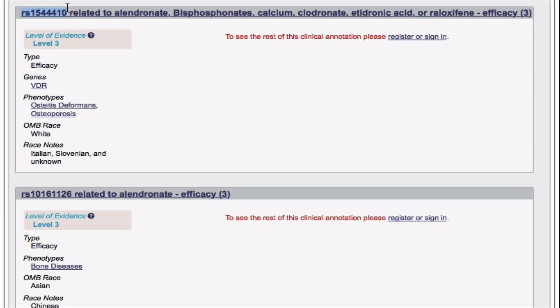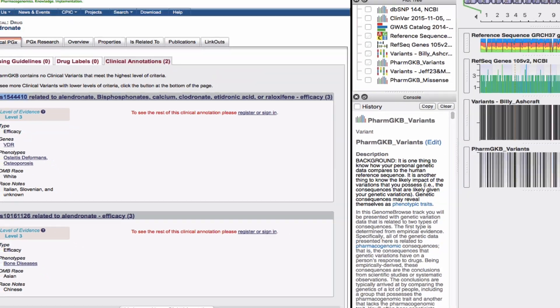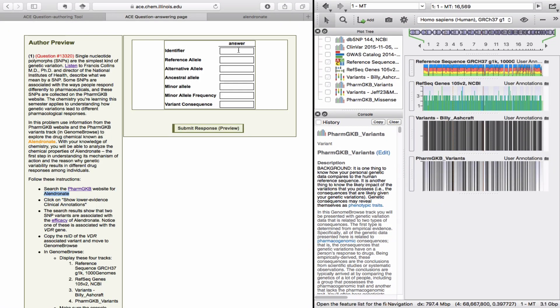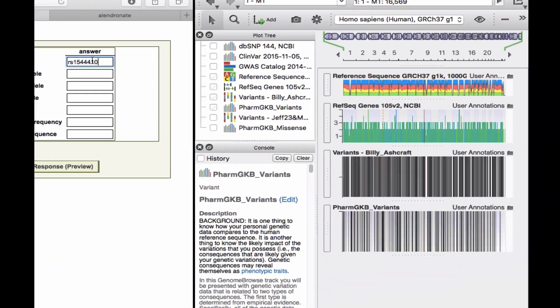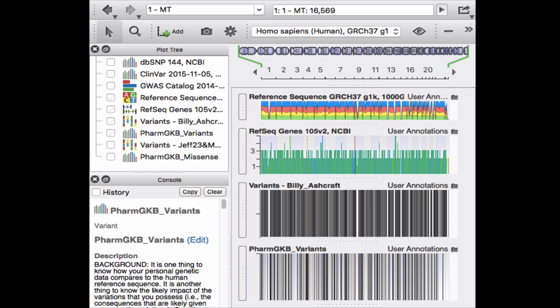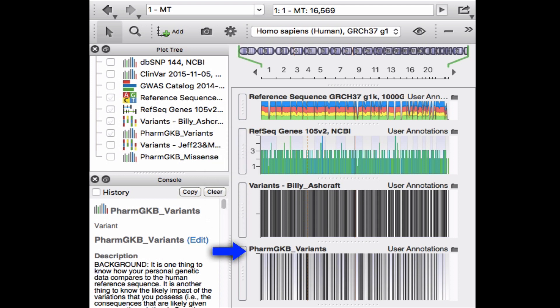Notice that one of these variants is associated with the VDR gene. Copy the RSID of the VDR-associated variant and move to Genome Browse. In Genome Browse, display these four tracks: Reference sequence GRCh37, RefSeq Genes 105v2, Variants, Billy Ashcraft, and PharmGKB Variants.